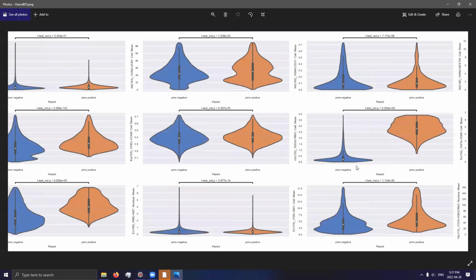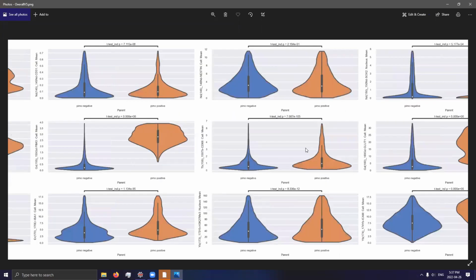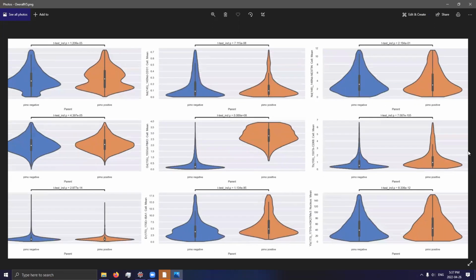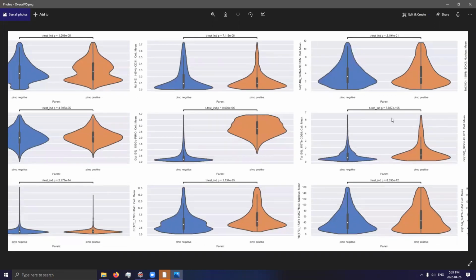Something like this would make an excellent figure for determining whether or not there is a difference in distribution of marker intensity across multiple regions that have been identified throughout multiple IMC images. Because at this point, we're not really separating our experimental from control group yet. We're pooling all negative areas from both the experimental and the control groups, and all positive areas from all of the experimental and control groups together.